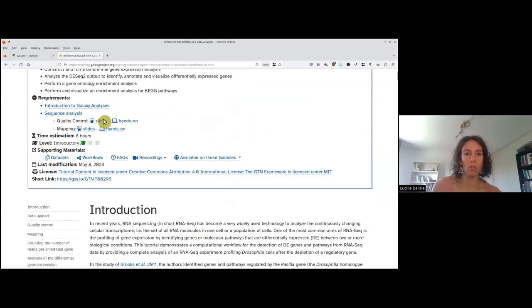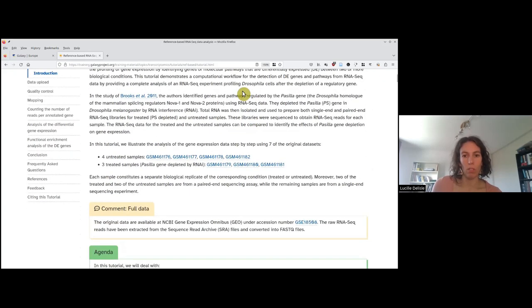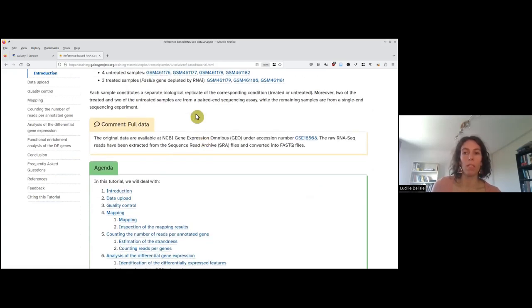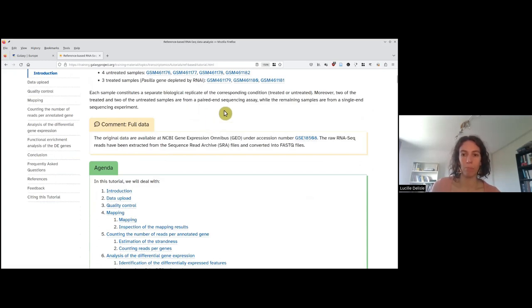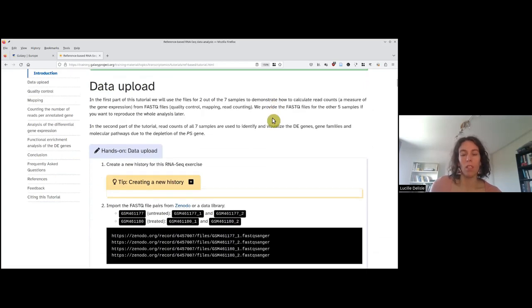Here are the links for the tutorials I recommended you do before performing this tutorial, and here is the introduction. As I said, there are seven datasets, and here are the public links that the authors published where the data are available. We already extracted the FASTQ files — the raw sequencing data — into Zenodo to enable you to more easily get data into Galaxy. We are going to process only two samples as a demo, and if you feel brave enough you can process the other five, but we will provide you the results for all seven samples so we can work on the second part.